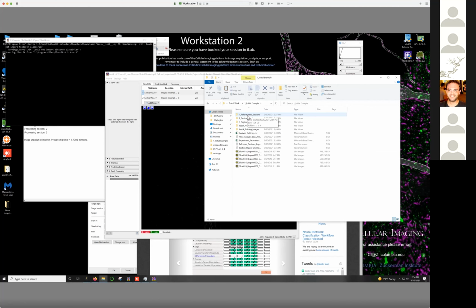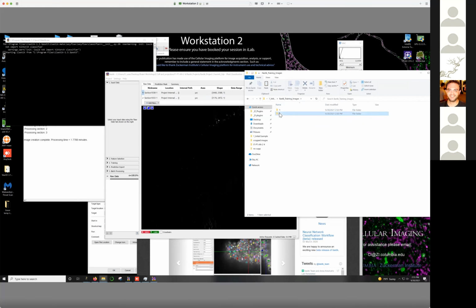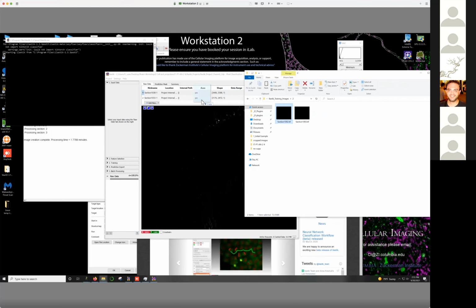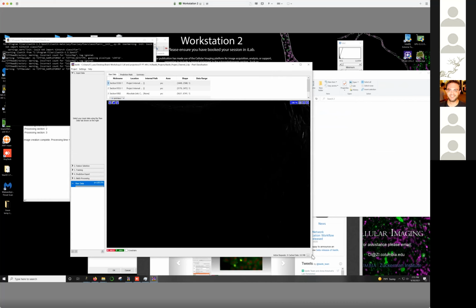You want to be doing this training and then running it as it is across all the animals. So in the training images here, I would just go in here and grab an image and drag it into the project. Really important step. If this was starting from scratch, I would select the old data and just hit reset.